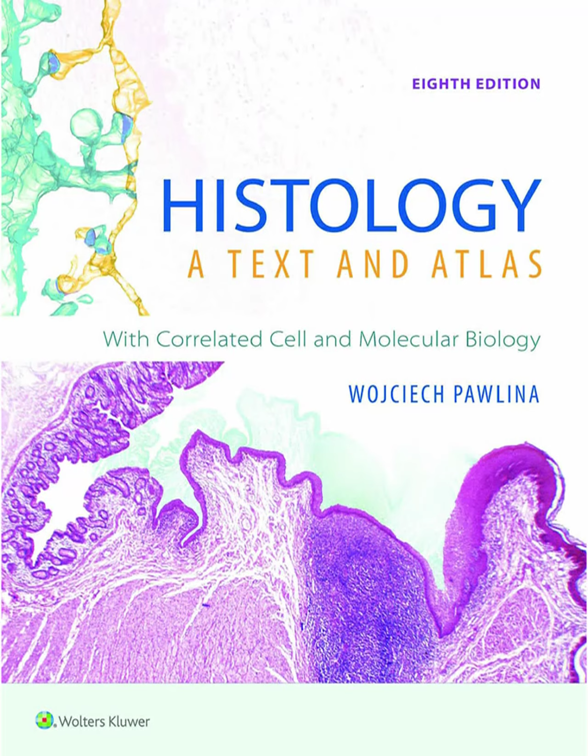Why would you want to quantify DNA? Oh, it's incredibly useful clinically. Pathologists use it to study DNA changes in dividing cells, maybe during cancer development, or to analyze ploidy, the number of chromosome sets in malignant cells. Abnormal ploidy patterns can give crucial information for evaluating tumor prognosis and predicting treatment response. That's powerful stuff from a simple stain reaction.